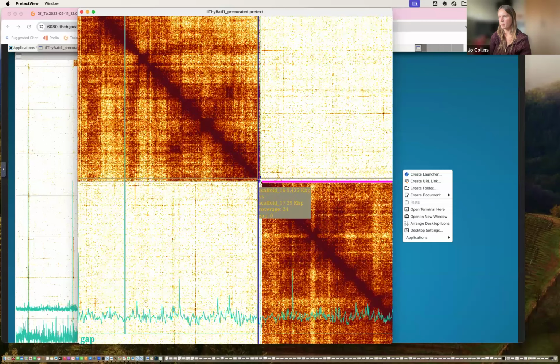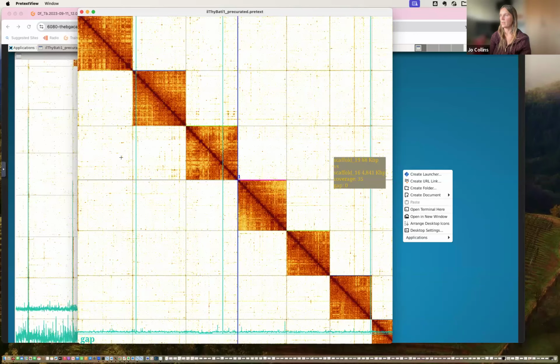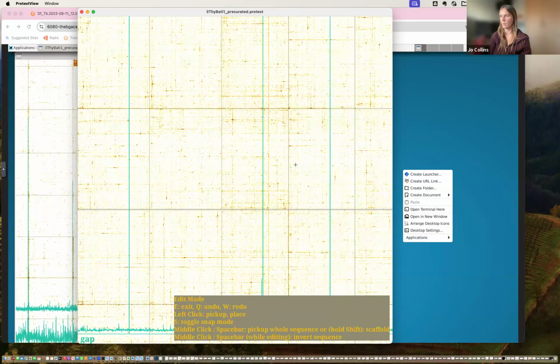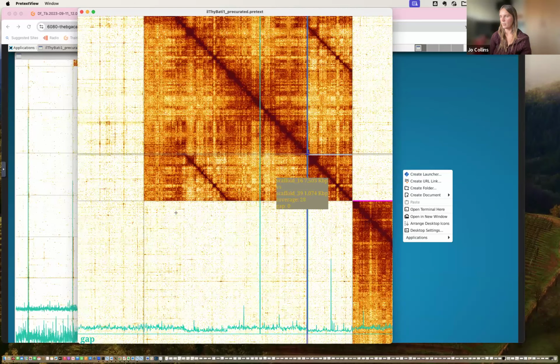Oh, this was our piece where we moved this little piece to. This was our chromosome where we moved the piece that we took out of the other chromosome, and we just left it there with our waymarker tag on. So we can see already this is looking very familiar. We've already looked at one of these. So let's pick this piece up because we need to remove it anyway. So you can see exactly the same issue as before.